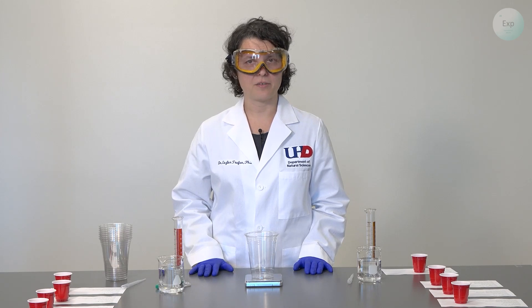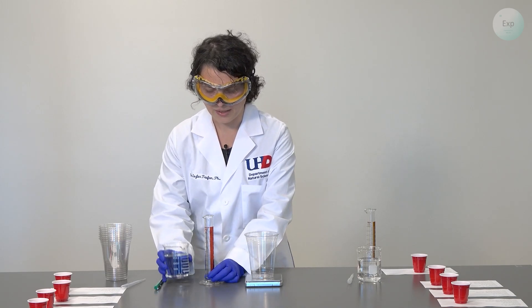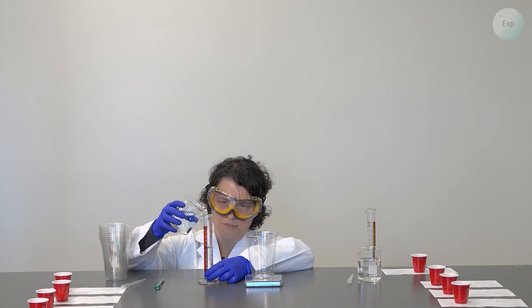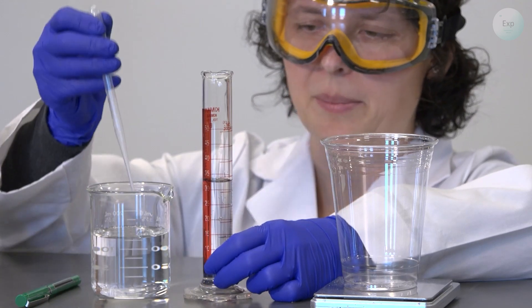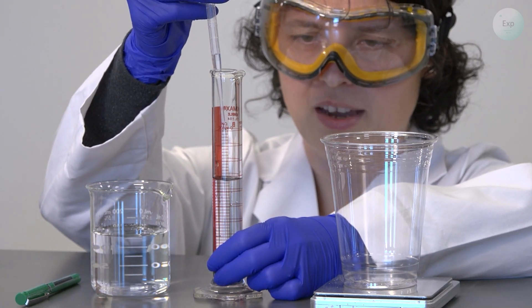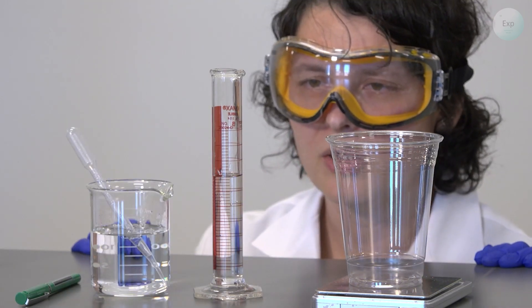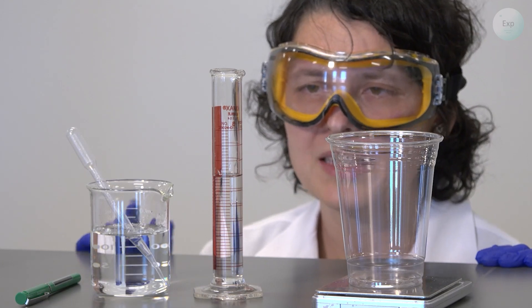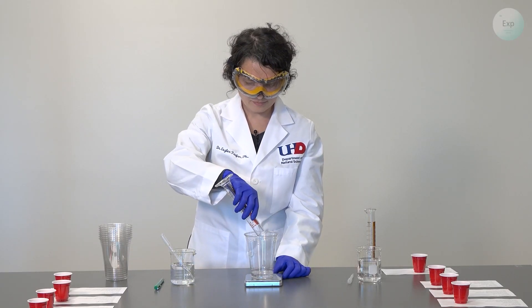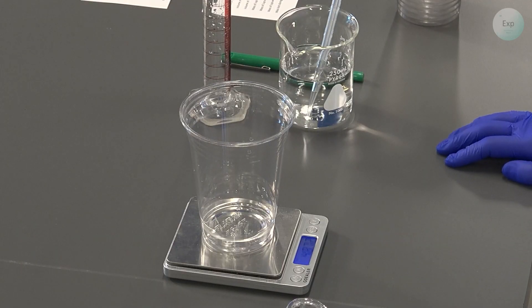Next, I am going to add 35 milliliters of water into this cup. I will try to get as close as possible to 35 milliliters using my graduated cylinder. If I am close but just under it, I can use my pipette to get exactly to 35. The volume of the water I'm adding to the cup is exactly 35.0 milliliters. After transferring, I will record the mass: 48.72 grams.